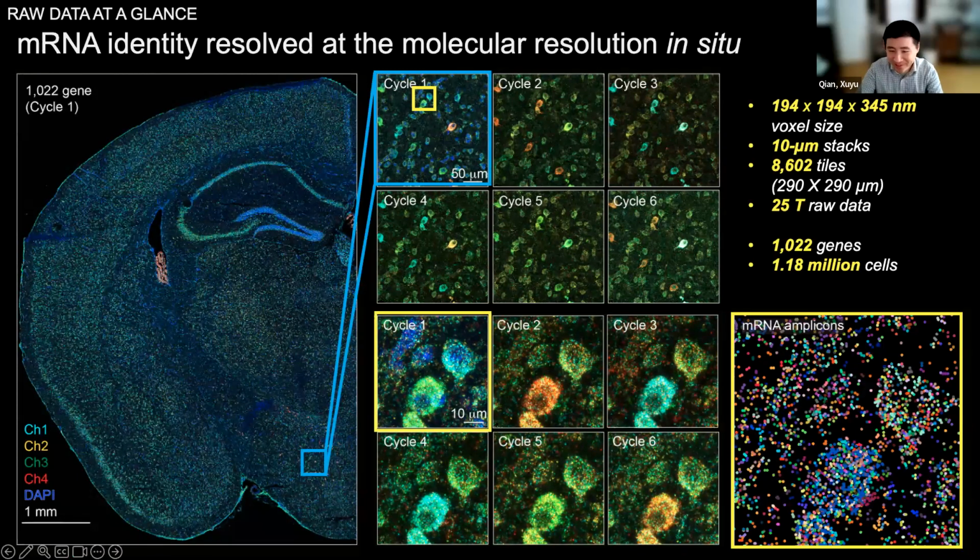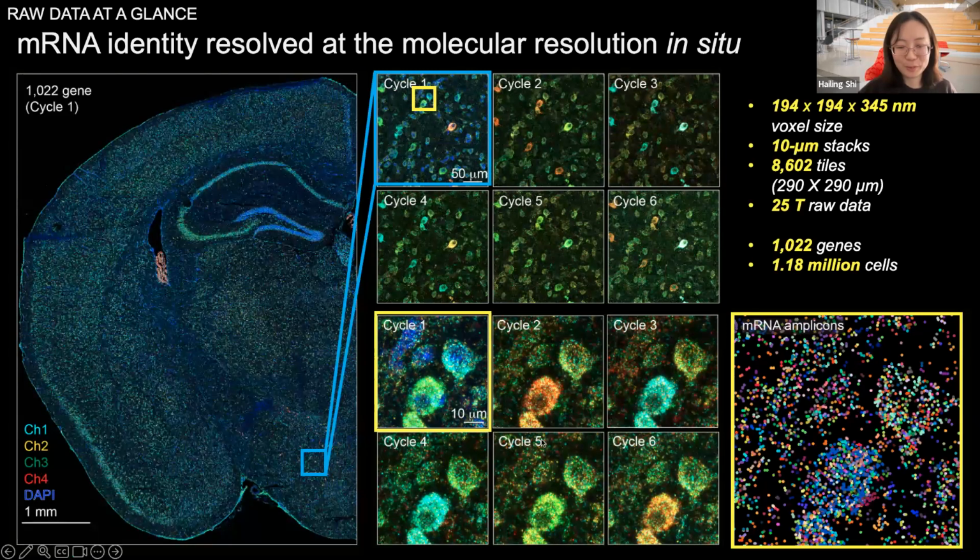So far your imaging has been done on a conventional confocal microscope? Yes, it takes a long time then. There's no special instrument requirement as long as we have a nice confocal and, say, 4 color channels that can be clearly differentiated from each other, and then we are good to go.